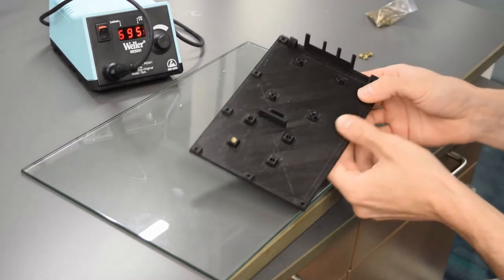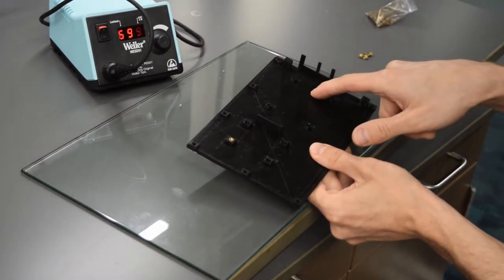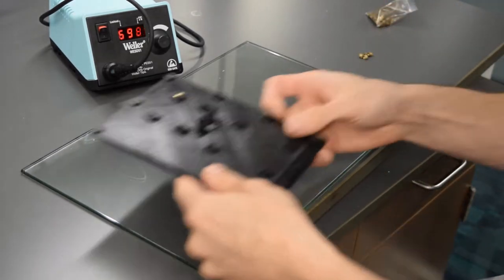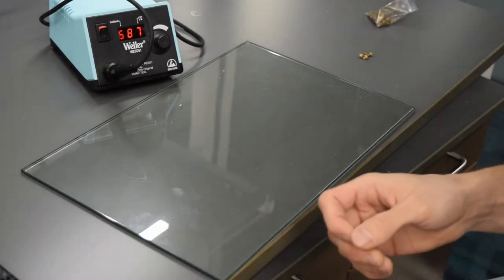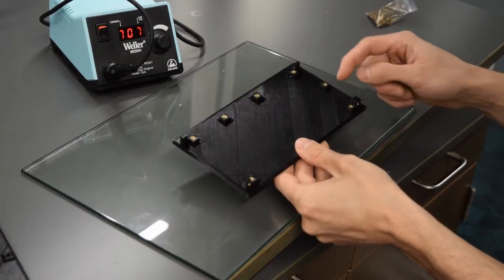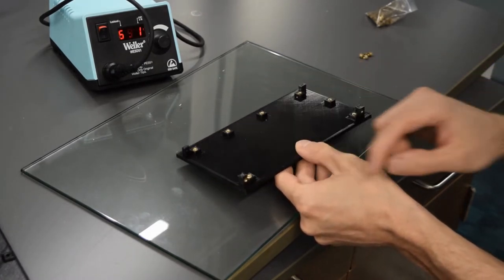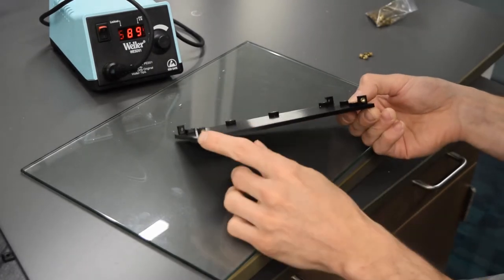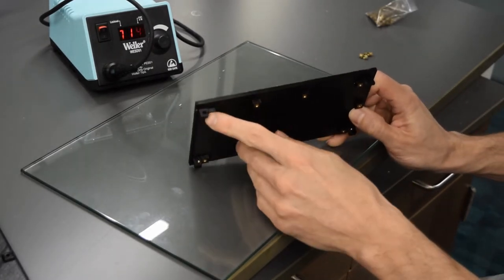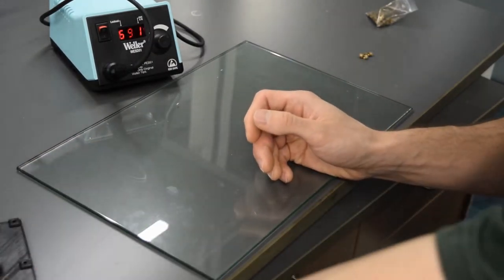So again, on the Pi wall here, there's four here for the relay board. There's four M2 for the Pi. There's two more M3 here on the side. For the bottom, where the PCB is gonna go, we have 1, 2, 3, 4, 5, 6, 7 M3 on the bottom. There's two more M3 here. And then these two at the back are for screws. So those two don't get heat set inserts.